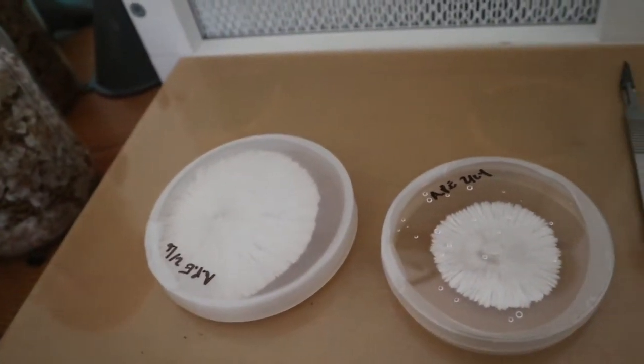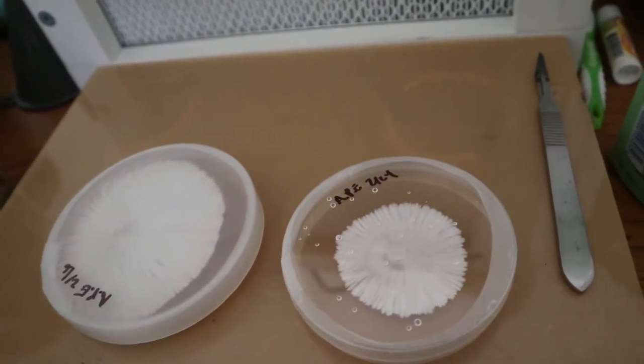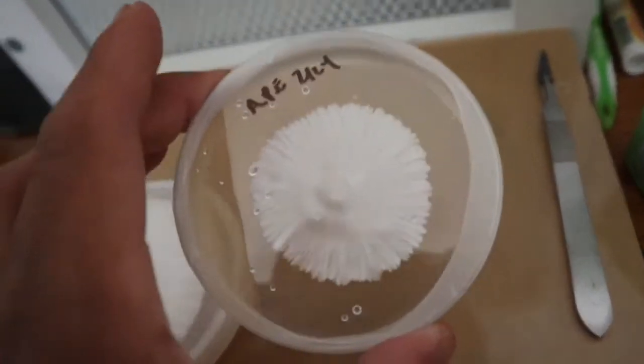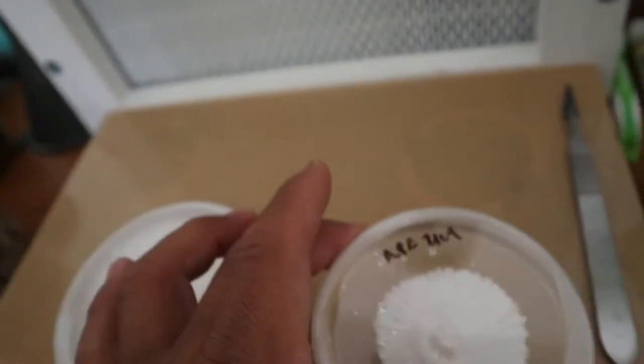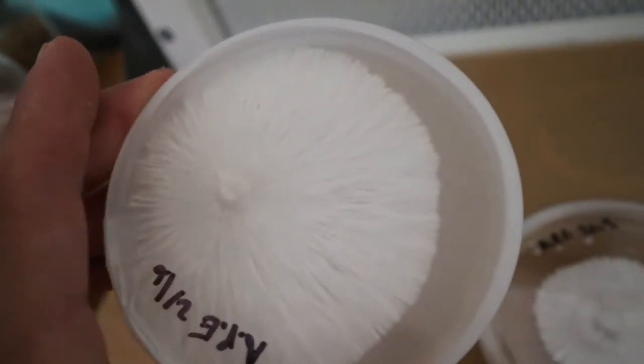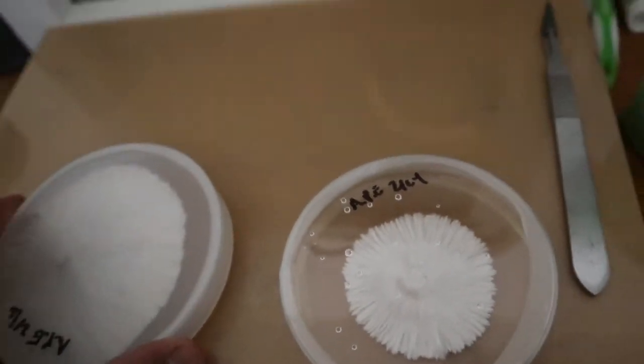And then they also make the glass ones. I've been looking into those, but those glass things, I don't know if you're going to have an instant break, but it'll be a cleaner product at the end of the day. Basically you'll be able to see the mycelium, and then right here you can see it, but it's not as clear as day as this one right here.